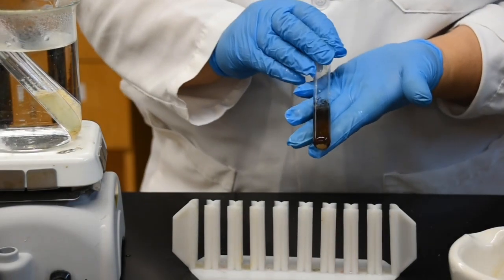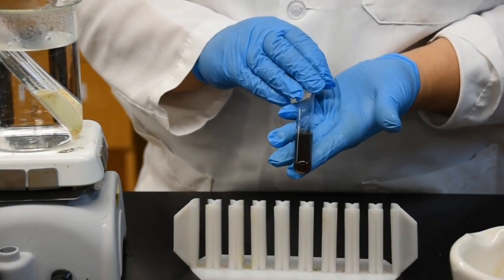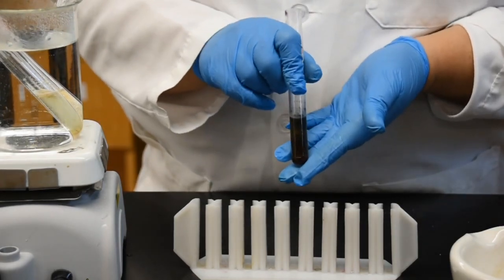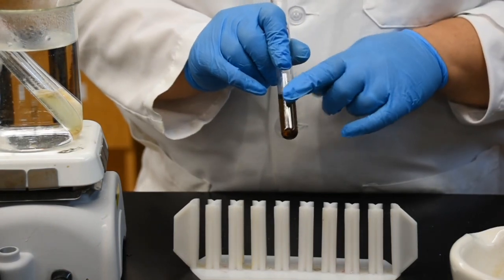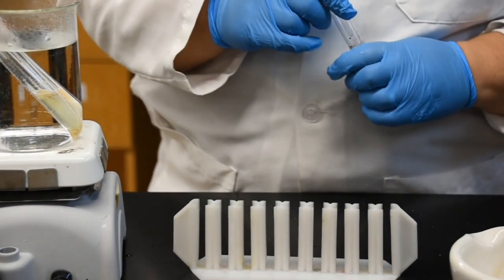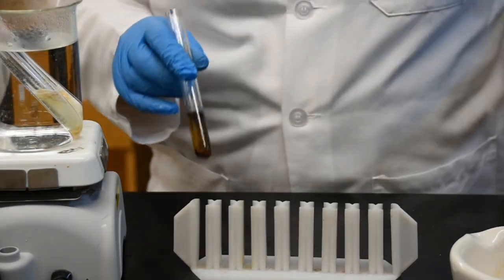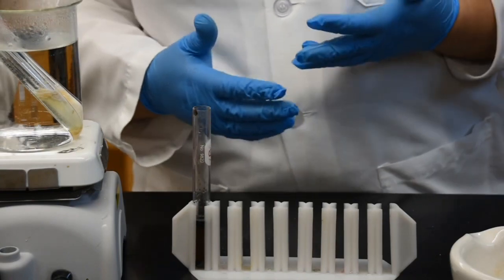Notice that this sample, which is my Lugol's iodine, has already changed color to bluish black, which means that this sample is testing positive for starch. So that's a really good indicator. Reminder, guys, the sample for Lugol's iodine does not need to be heated. So we're going to watch these samples for any color change, and when that happens, I will let you guys know. Now, please do know that I'm not going to show you every sample that I have here. I will show you your final results.